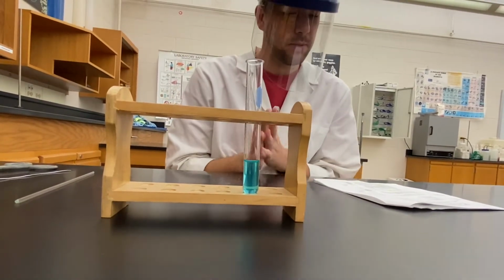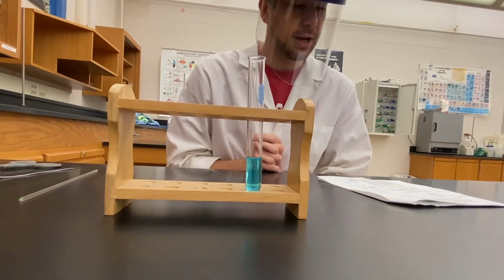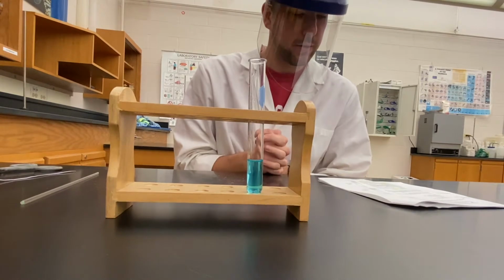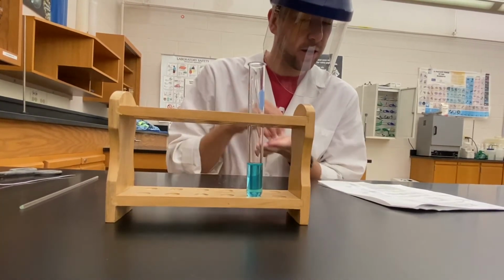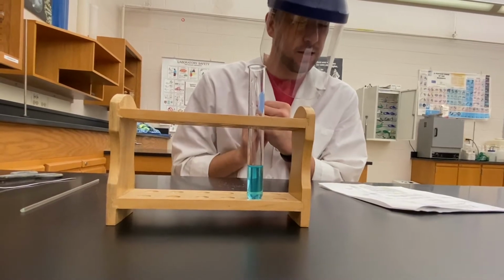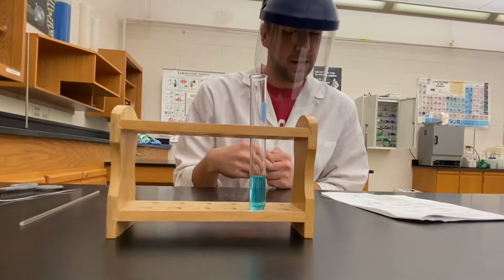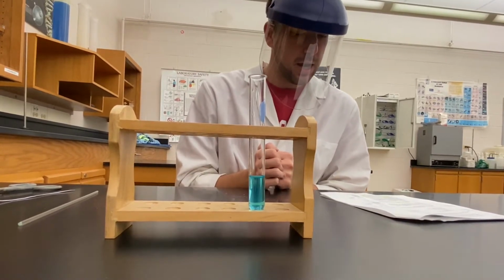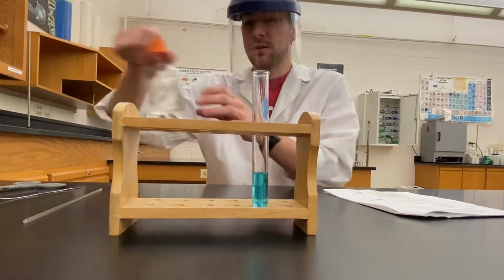Our next step, I'm going to add another solution. The next solution I'm going to add is sodium hydroxide. And then I'm going to mix the solutions with a stirring rod. I'm going to rinse the stirring rod into the test tube. And I'm going to touch the bottom of the test tube to see if any heat has been released. The copper-containing product of this reaction will be copper 2 hydroxide, and the other product will be sodium nitrate. So let's give that a shot.